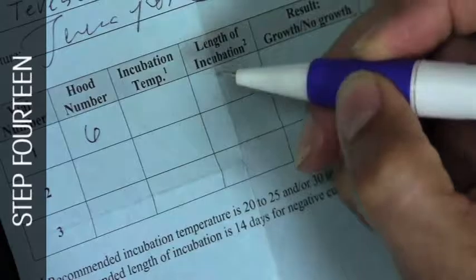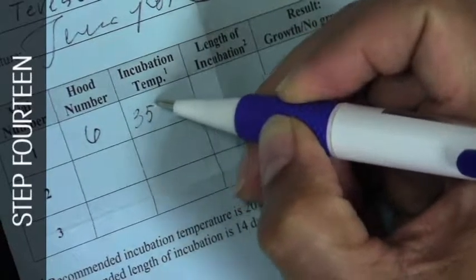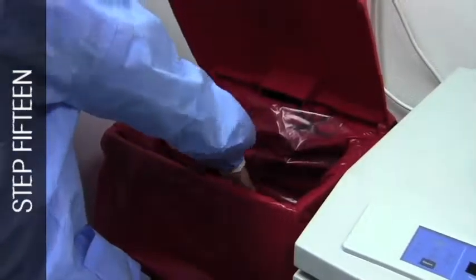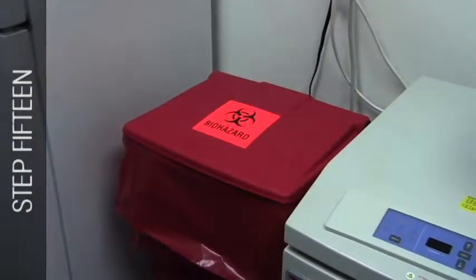Record results on the results log sheet. Discard all used syringes, needles, and completed test materials as biomedical waste.